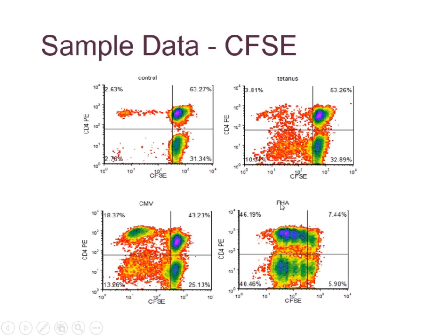And we've found, and others as well, have found that this is when you will see the characteristic multiple peaks. I think in the case of an antigen, everybody's kind of synchronized and they just all move as a group. With things like PHA or anti-CD3, they kind of go in cohorts.